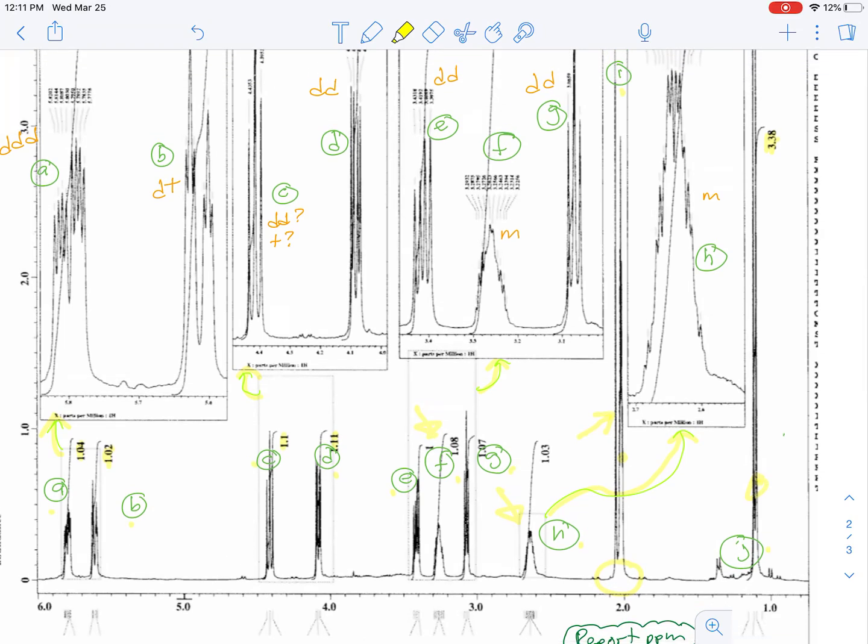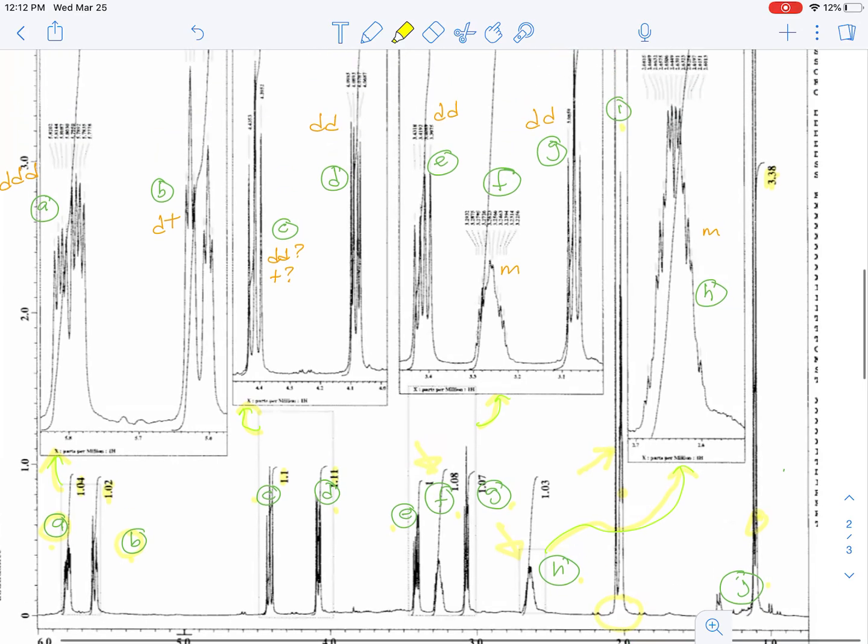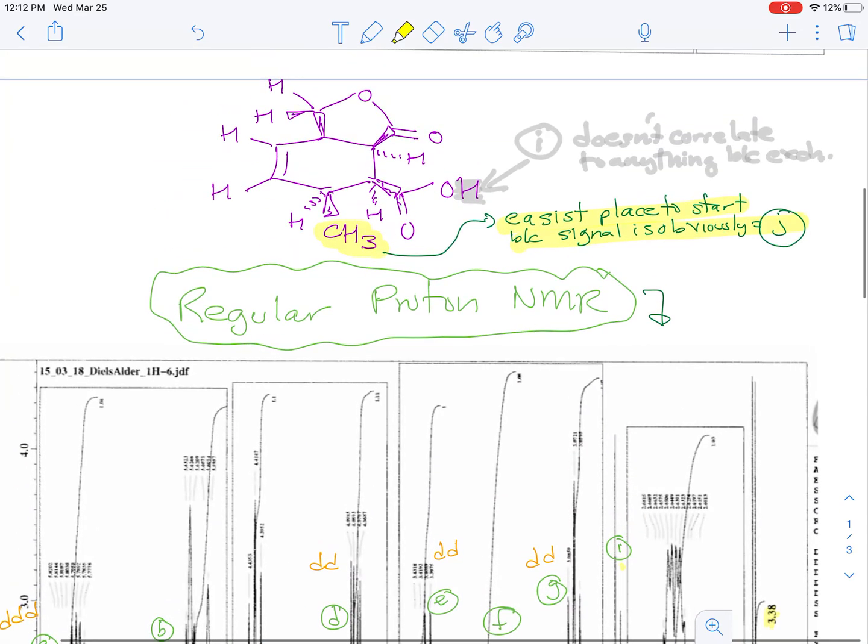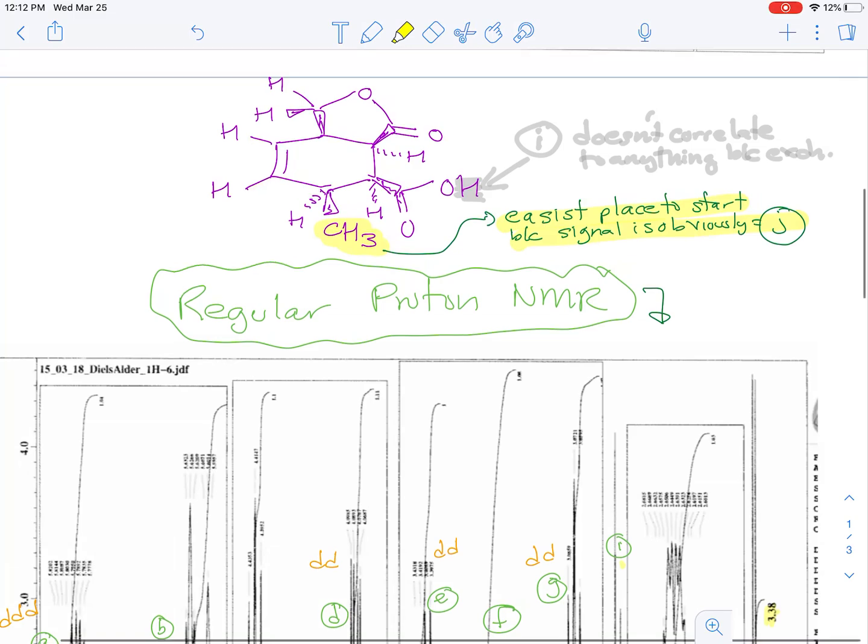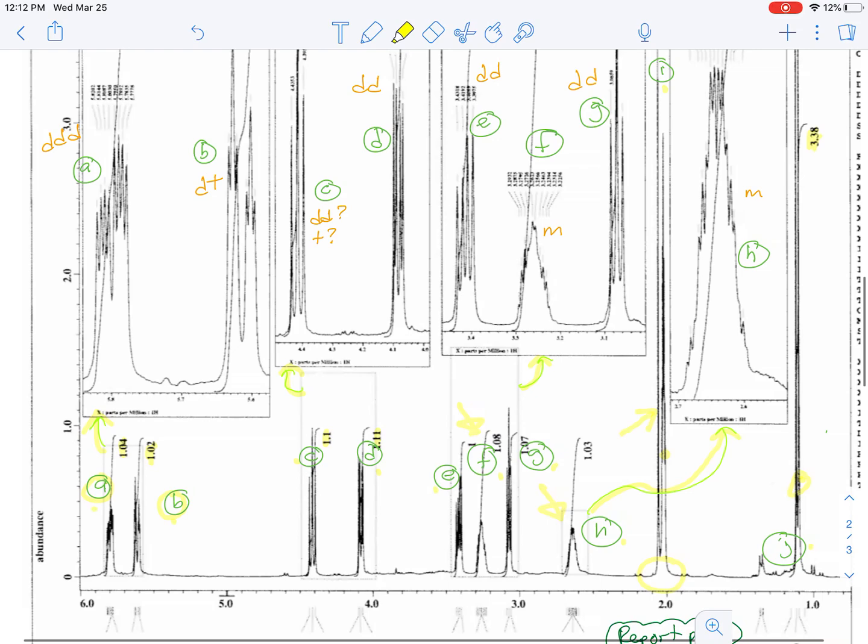When we go to assign these signals, it's pretty hard to assign them specifically. For example, we know that A and B are both the vinyl hydrogens, but we don't know which vinyl hydrogen, because if we look at the structure here, there are two vinyl hydrogens.